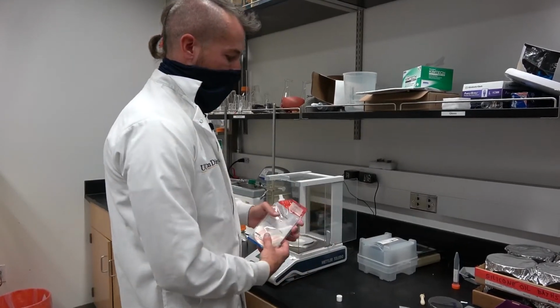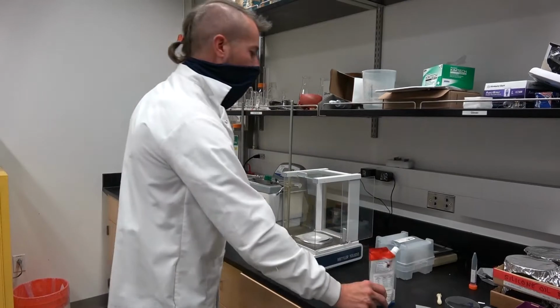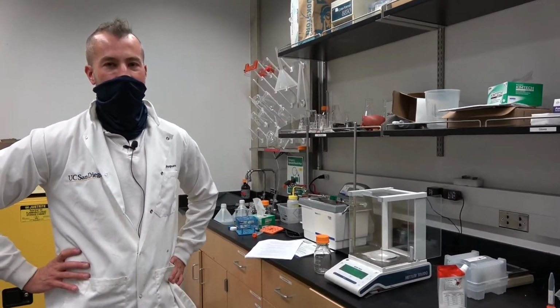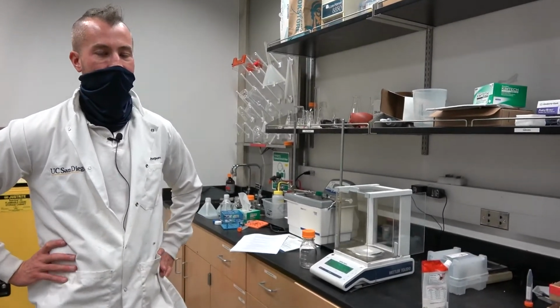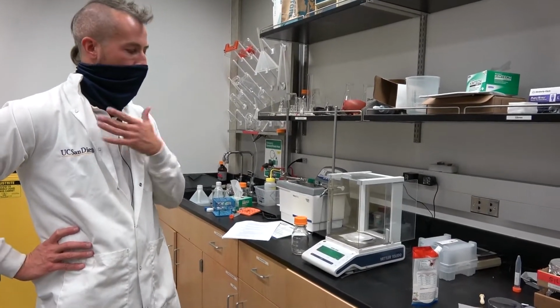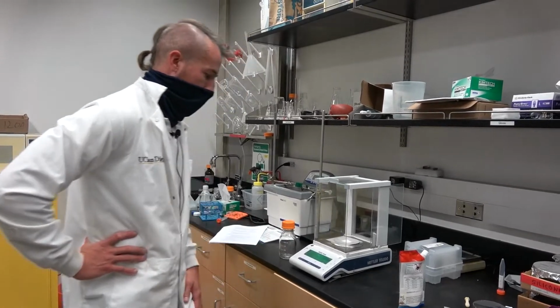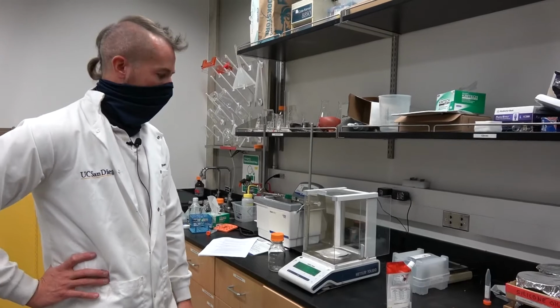And the good news is this is not necessarily a super precise determination. If this is 1% or 1.1% or 0.9% agar, it's not really affecting our sample because this is going to be consistent across all of our samples. But I'll be sure to record this as 1.066 grams.